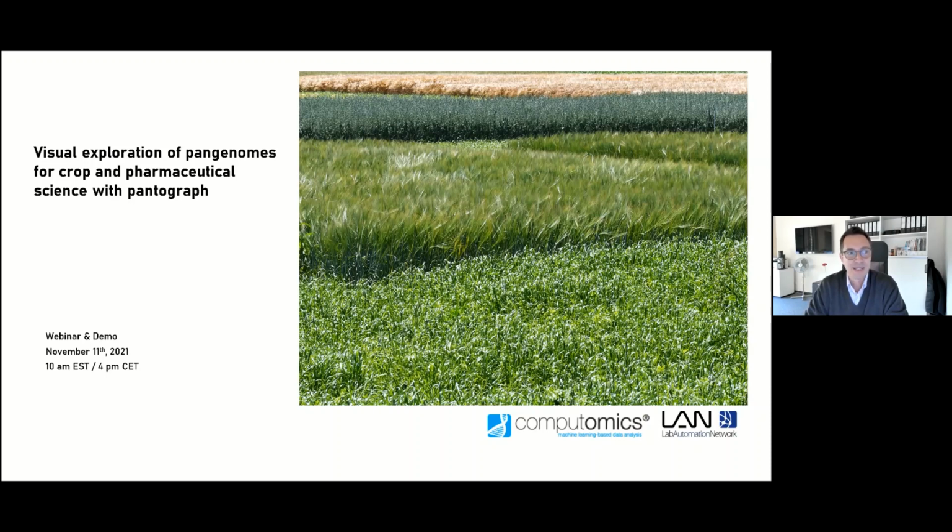And today's topic is visual exploration of pangenomes for crop and pharmaceutical science with Pantograph. Pantograph is a special software from Computomics that Jörg will introduce to you and show you in a live demo today.